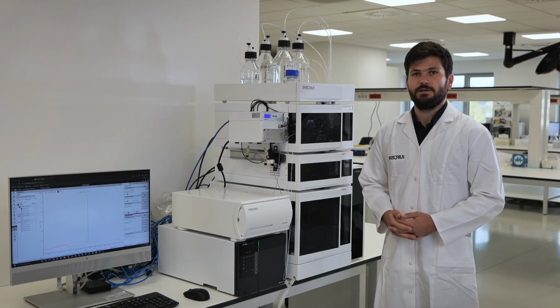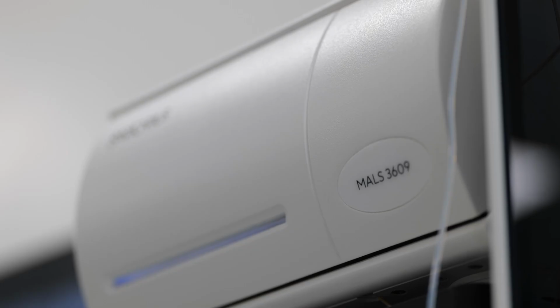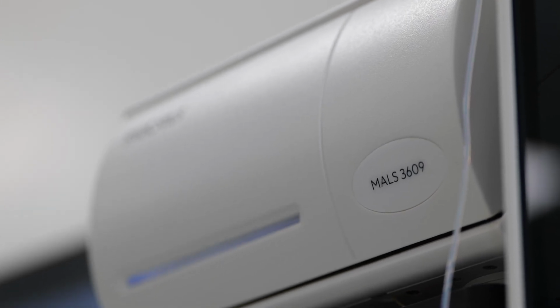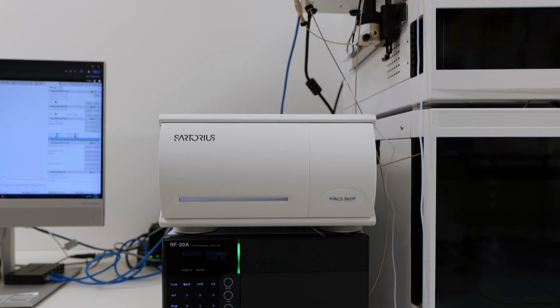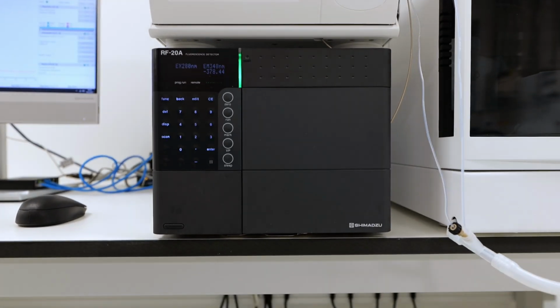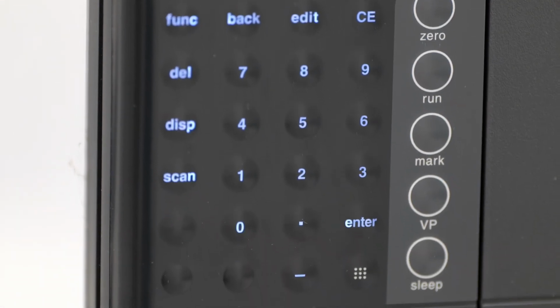The light scattering detector is particularly important for crude samples as it allows for specific tracking of particles like AAV capsids. At the same time, UV and fluorescence detectors provide valuable information on the removal of all other protein and nucleic acid impurities. Tryptophan for proteins and PicoGreen for DNA detection at the same time allows me to quickly see any residual impurities that might be present.